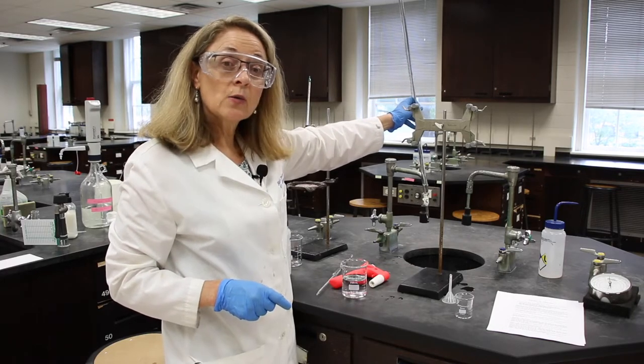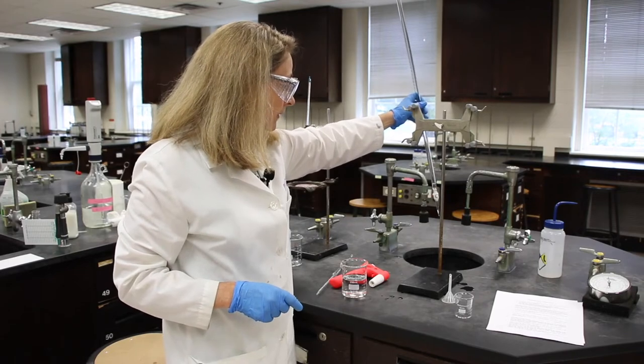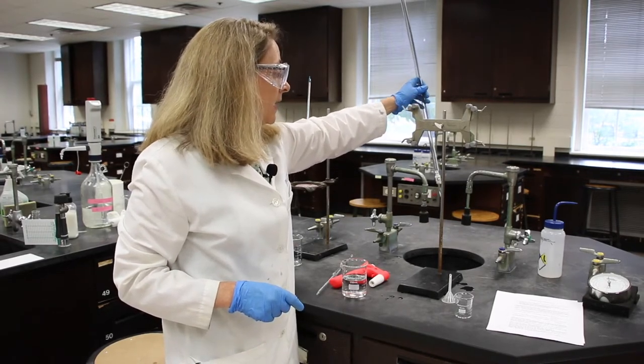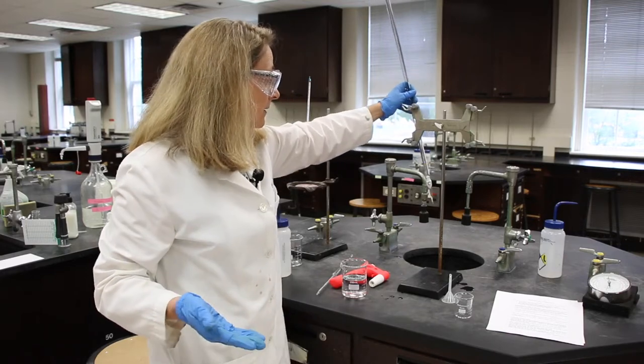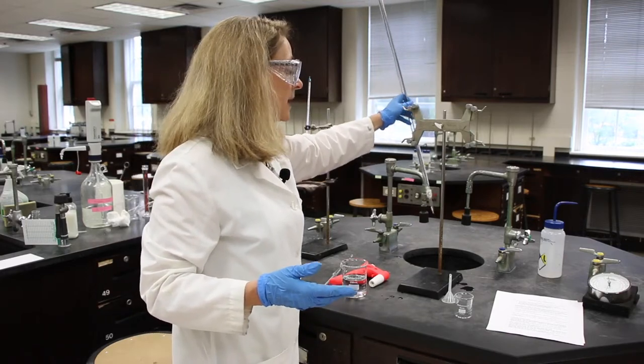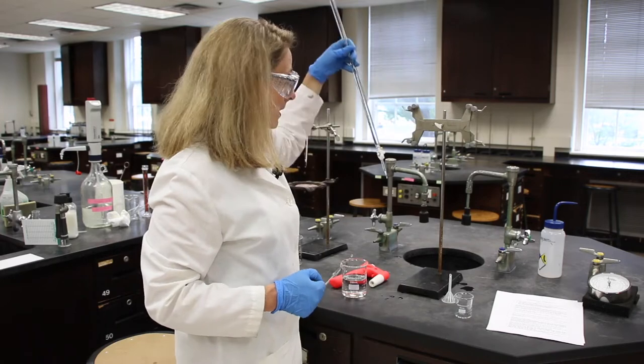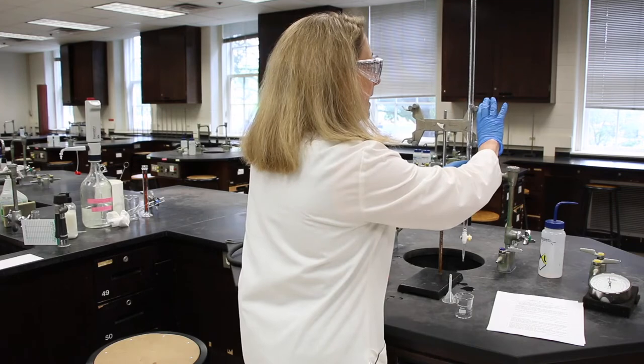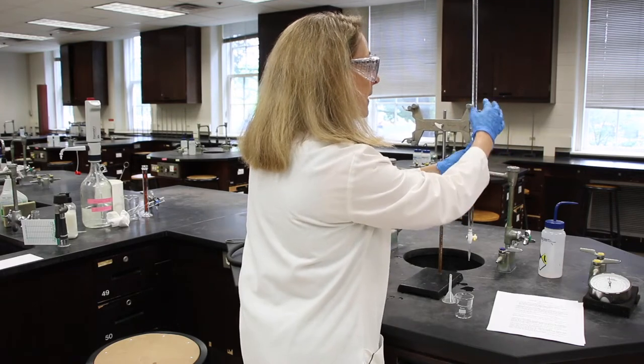Since it's DI water, it's okay to put this down the drain. You can refer to the lab manual every time we need you to put something to waste, and we'll tell you where it goes. When we're done with that, we're going to close the stopcock and put the burette back in the burette clamp.